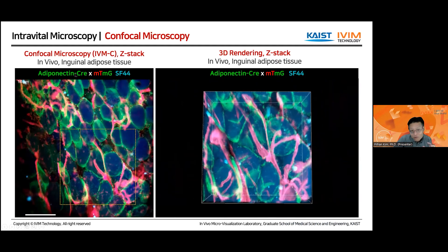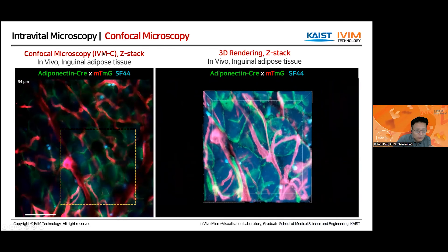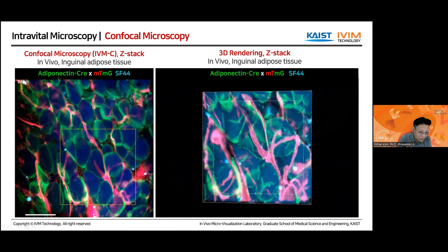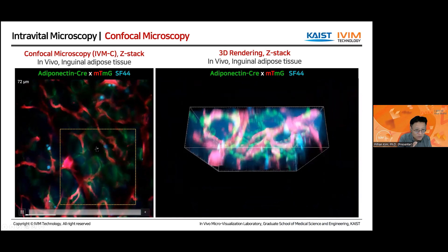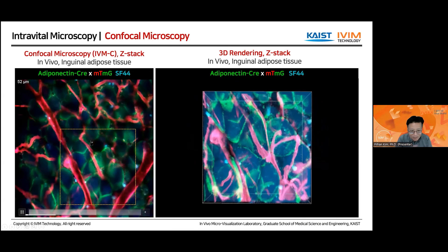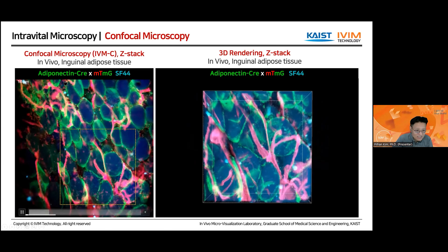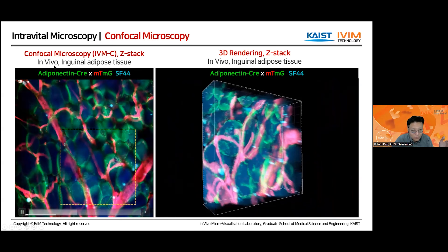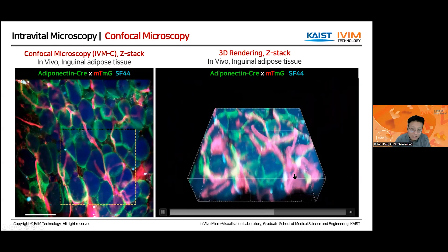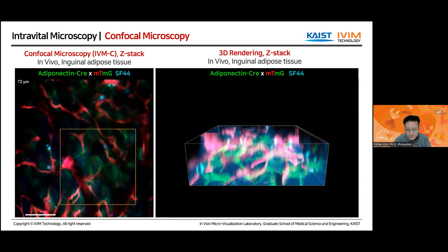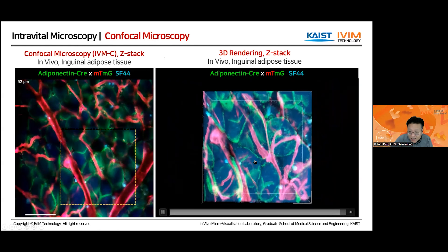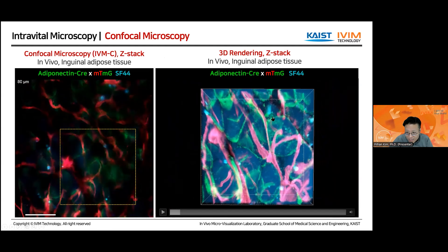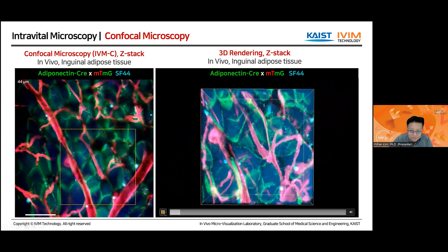Adiponectin is expressed in the adipocyte, so in green you can see the adipocyte, and in red you can see all other cells like endothelial cells and some immune cells. This is a 4-micrometer interval Z-stack image taken from the inguinal adipose tissue. Later we can make a 3D rendered video in very high resolution. If you look carefully, you can see small microvesicles shed out from this adipocyte in the middle.